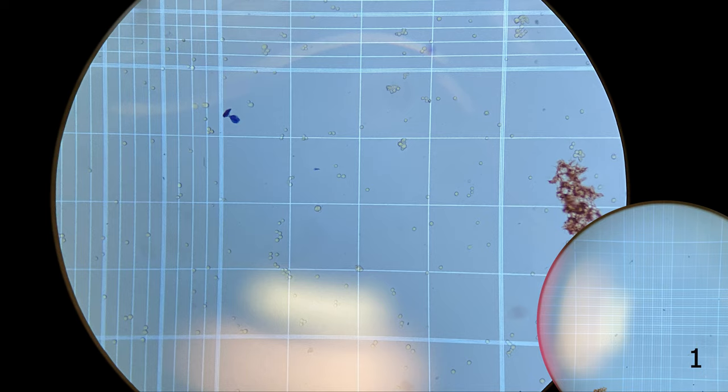I do want to point out on the far right side, there is a piece of fluff, probably from the Kim Wipe. The Trypan Blue did stain it and now it is on our slide. Thankfully, it's not covering the P-square.